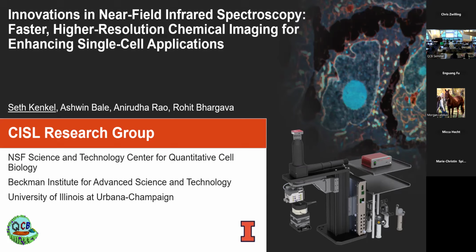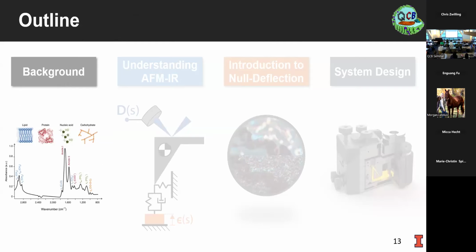But shown here is one of the first results, published in PNAS 2022 with the original system, showing contrasts based on the IR absorption of the different molecules in the sample, showing multiple different colors. Today, Ashwin focused on the actual preparation of these samples. I'm going to focus more on the development of the new system.